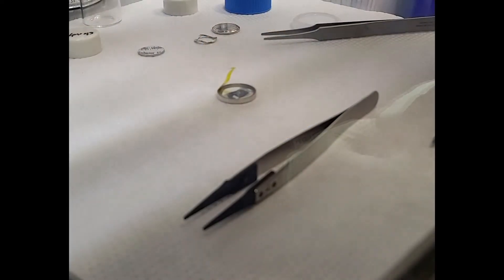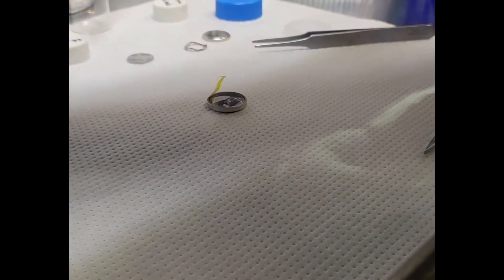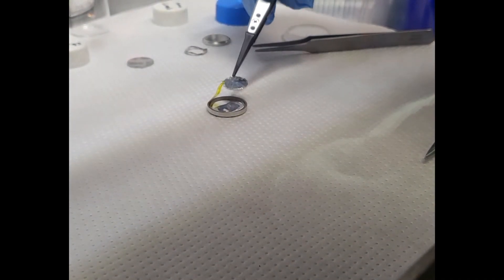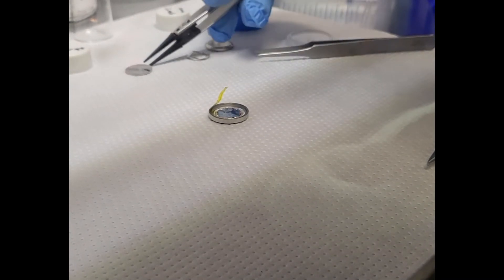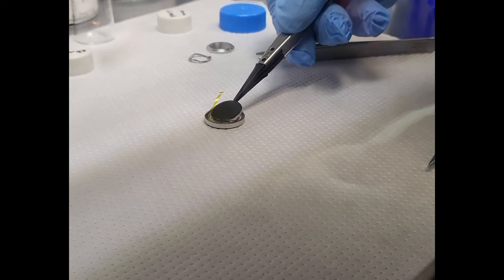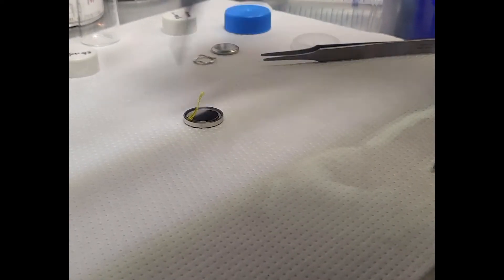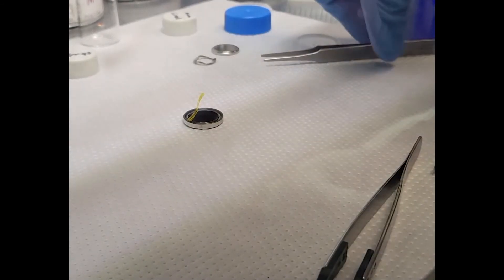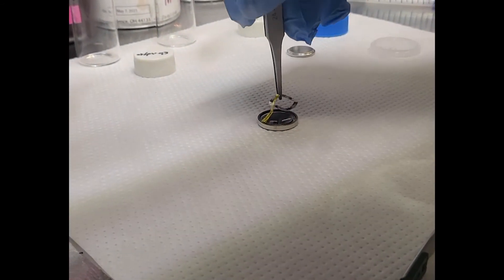Now it's time to assemble the rest of the cell. Using the plastic tip tweezer, place the lithium metal on top of the separator. Then place the spacer. Notice that Jimmy is a bit nervous here, knowing that so many people are going to be critiquing his cell assembly skills. Now with the non-lithium metal tweezer, continue with the rest of the assembly.